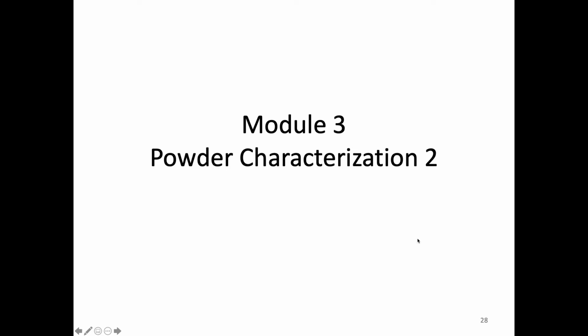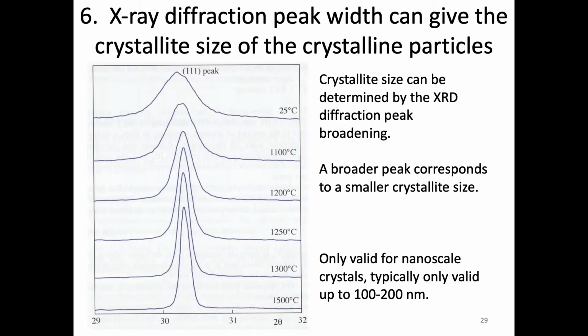All right, let's continue talking about powder characterization techniques. Where we left off was on my list of 11, I believe. So this is number 6, and this is X-ray diffraction.